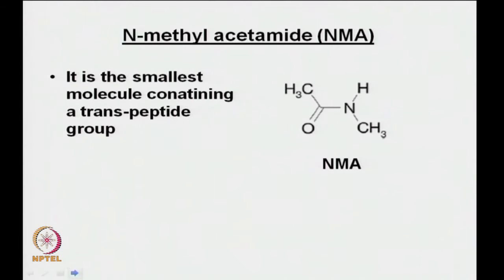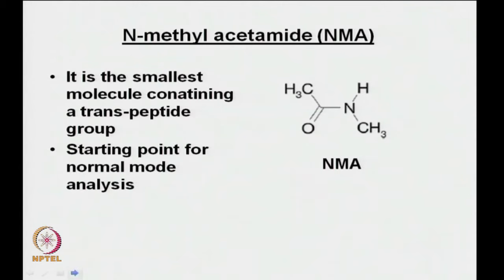It is the smallest molecule containing a trans peptide group, and it is the starting point for normal mode analysis.